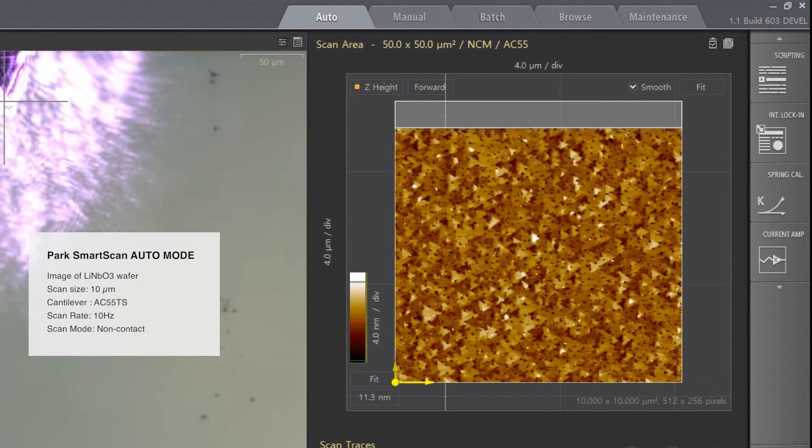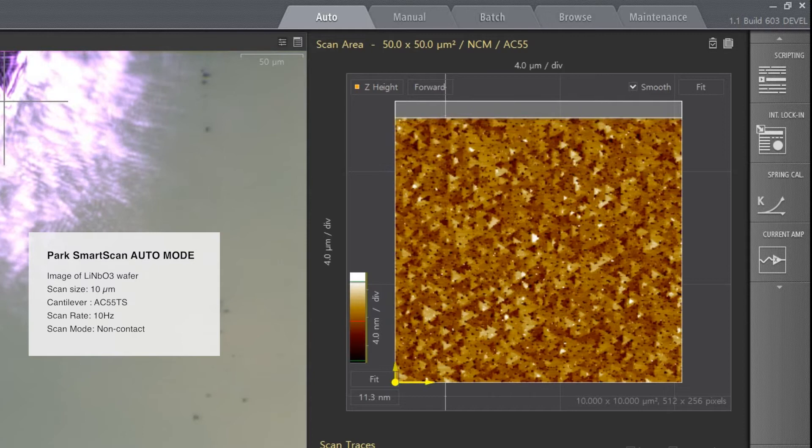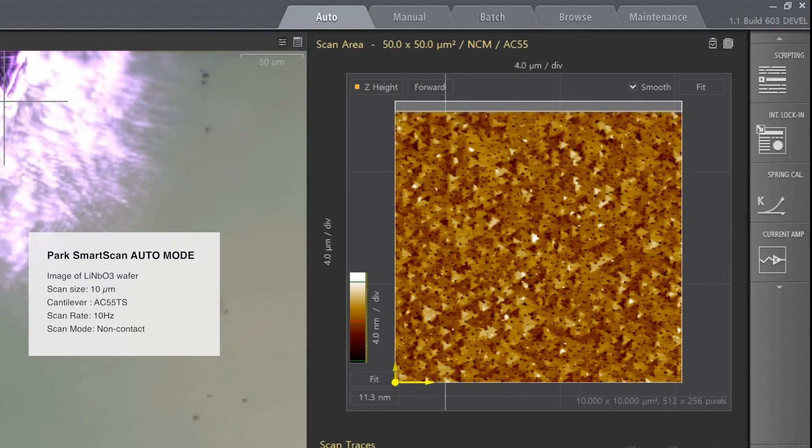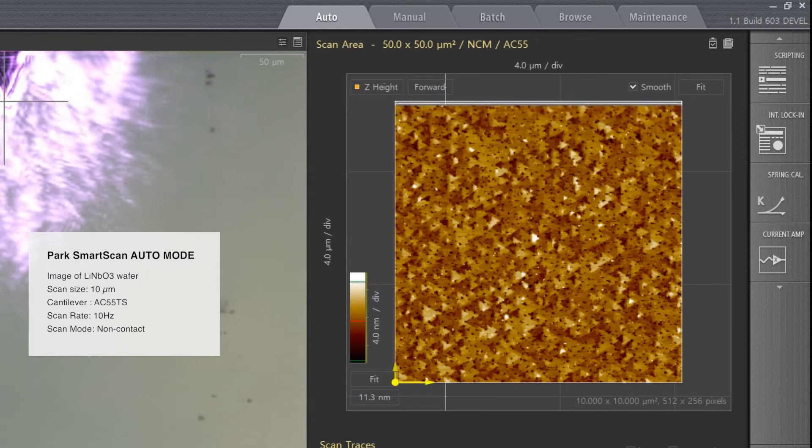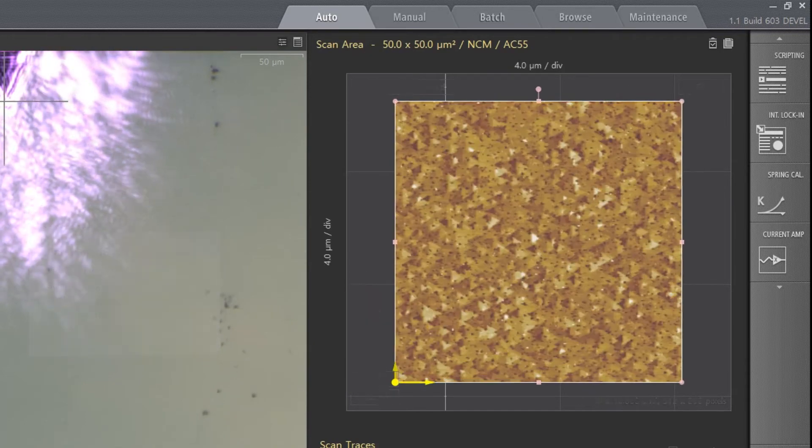Park NX Series AFMs only need an ultra-high frequency cantilever to carry out high-speed AFM imaging using ParkSmartScan.